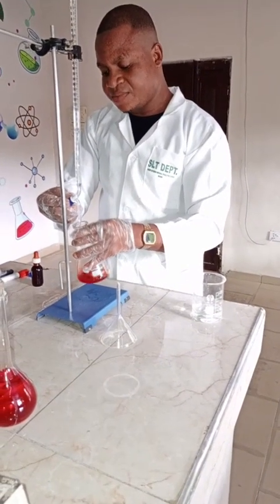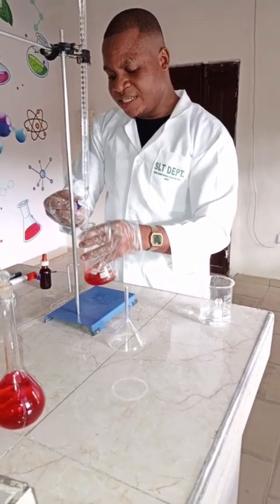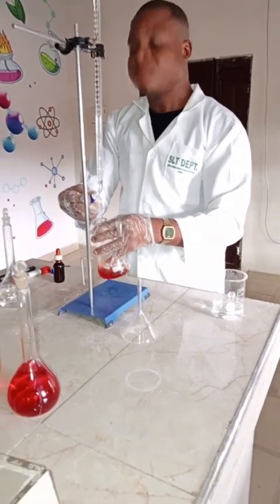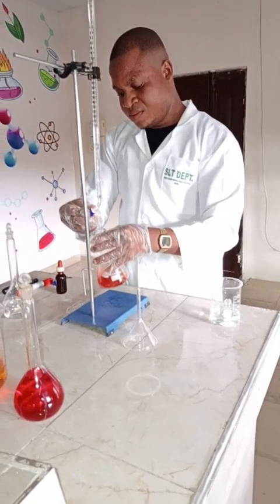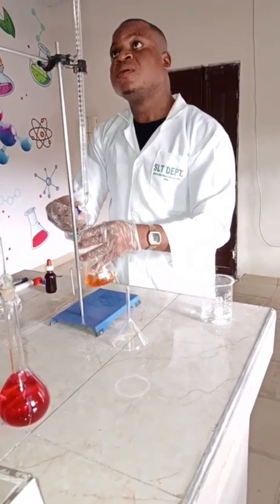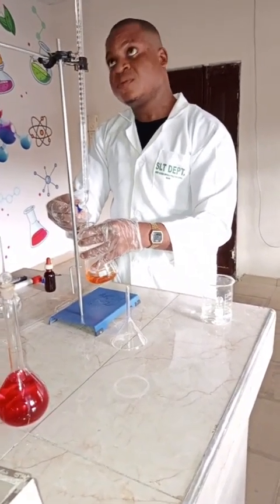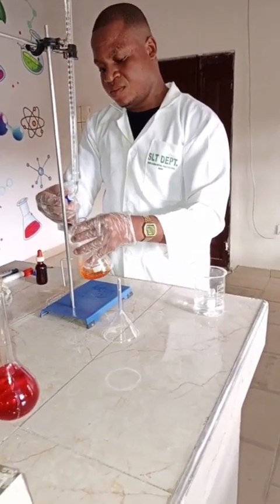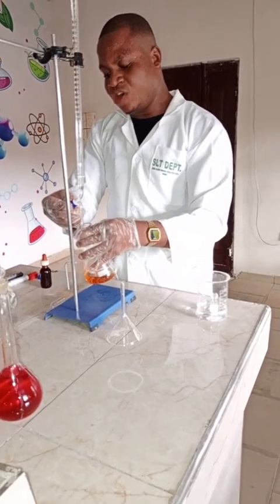Do it gradually. Be noticing that it is changing gradually. Add drops by drops.